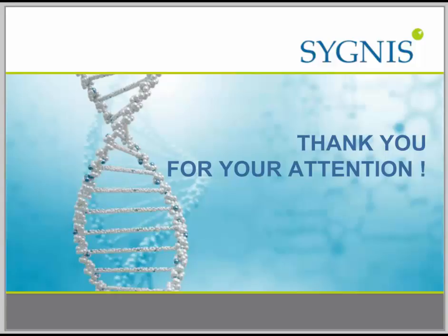So we indeed have a quite similar length. The fragments amplified are a little bit lower in length than the random primed MDA. The reason why the coverage pattern is much more even with the TruePrime method lies in the priming process. We believe that there's bias introduced by the random hexamers, and that the PrimPol leads to a much more distributed generation of priming events during this process.